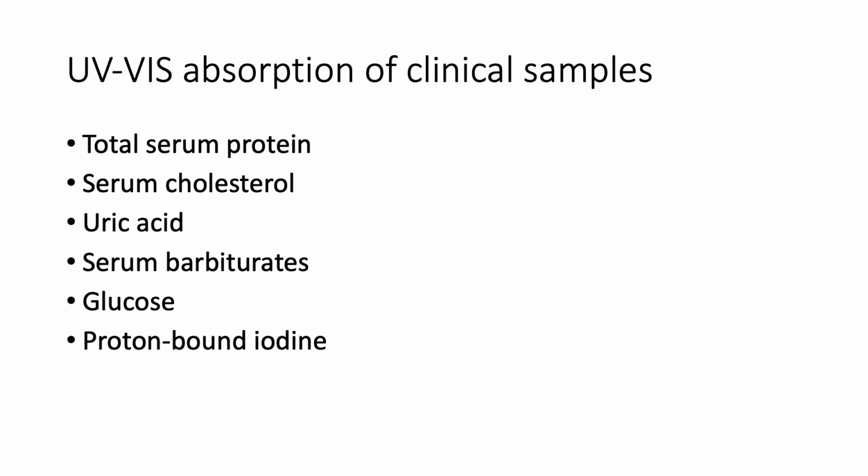Okay. Now, sometimes you can easily measure. You can set up your instrument. Maybe you're breathing into a breathalyzer or something else, and you don't have to worry about other things in there. You know, what else is going to be in your breath? Or you made the sample and your technique is only going to measure one species. But sometimes it's not so simple. Things get in the way. There's more than one thing in the sample, for instance. And that can make things complicated, right? Make it much more difficult if you've got a mixture of things. And I think you've run into this.